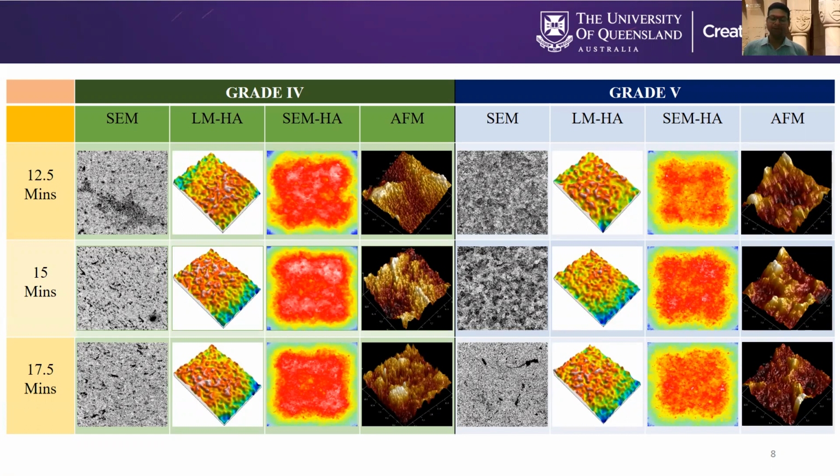The AFM also suggests a slight reduction in the peaks and the valleys, although in these images, as it records only a 15 by 15 micron area, it only provides data suggesting the gradual decrease in the peak height and slight shallowing of the valleys.